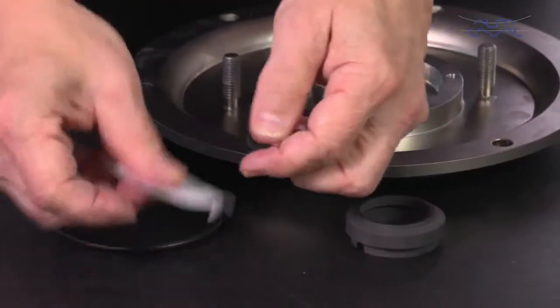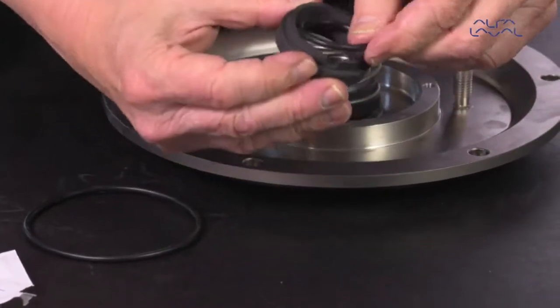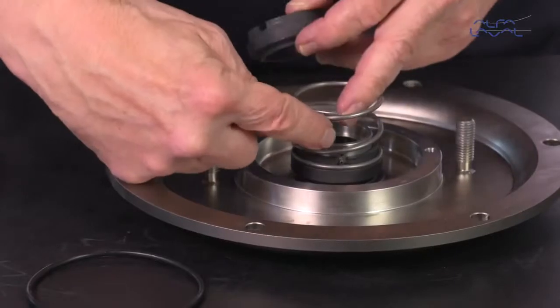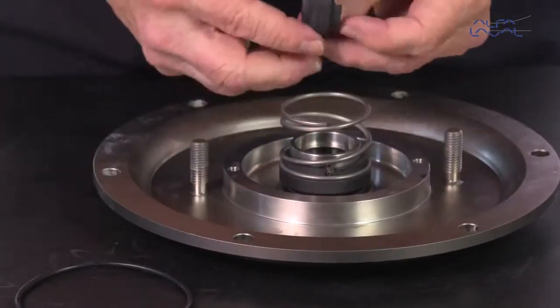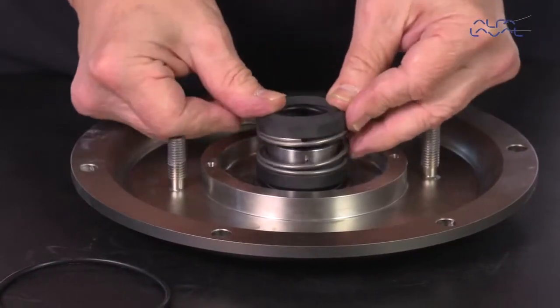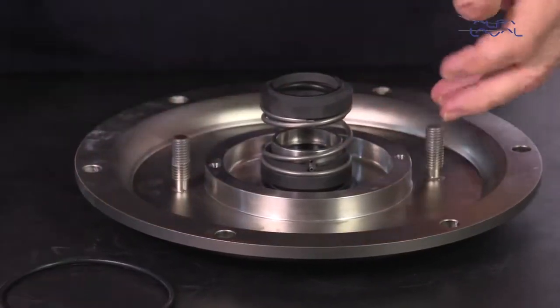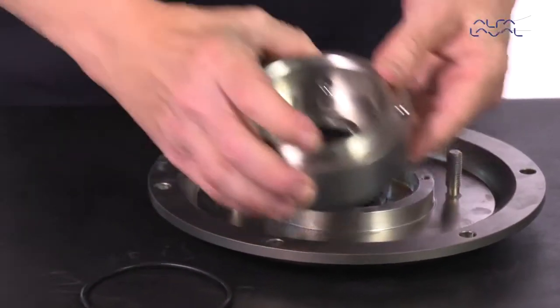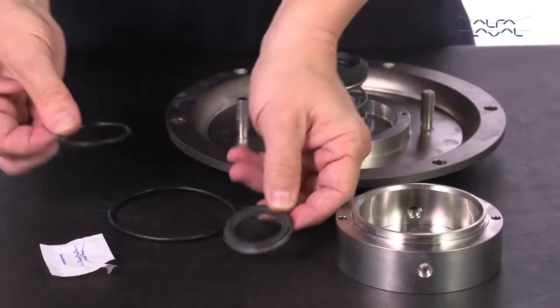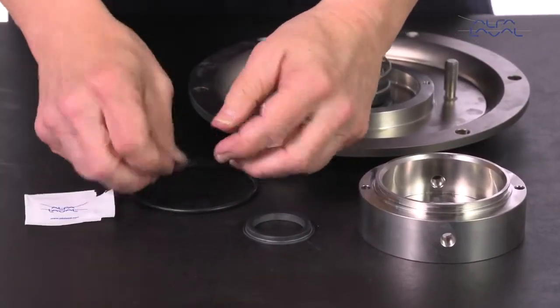Lubricate the o-ring and place it in the secondary rotating seal, then place this over the spring. Ensure that the driver on the drive ring fits securely into the notch in the rotating seal ring. Lubricate the o-ring and place it on the secondary stationary seal.